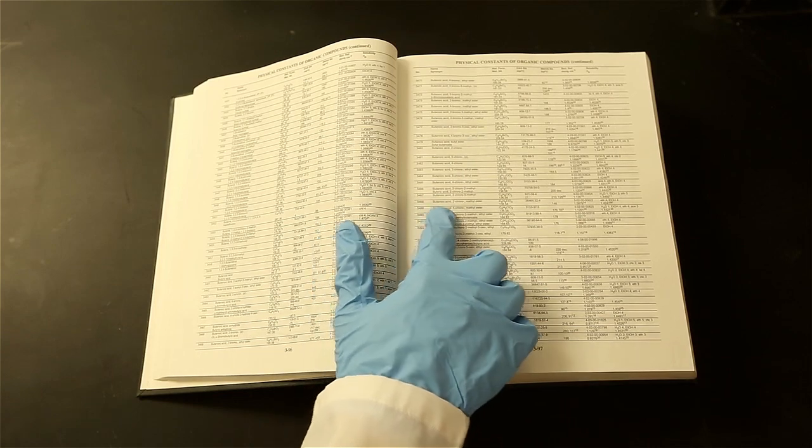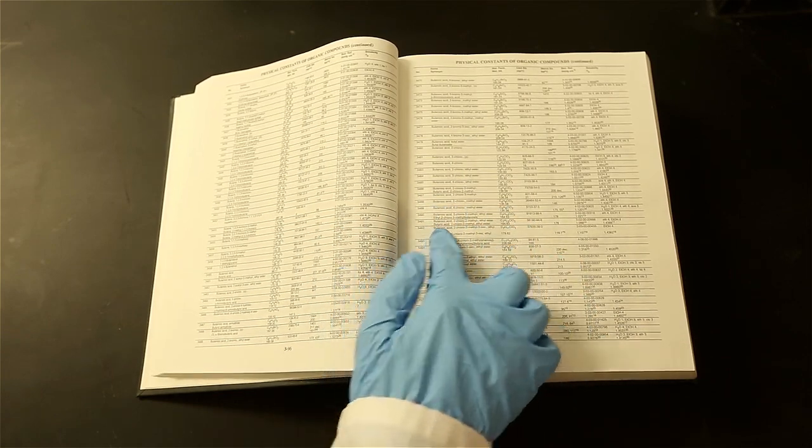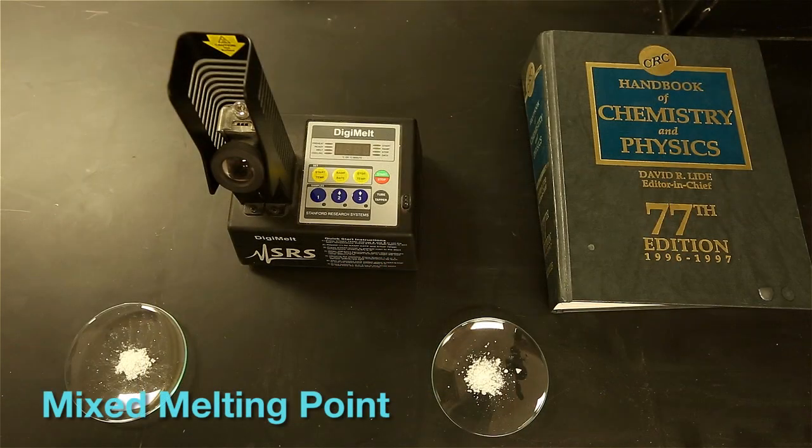Approximately 0.5 degrees depression corresponds to a 1% impurity. Now onto the topic of mixed melting points, which is a way to confirm your solid's identity.